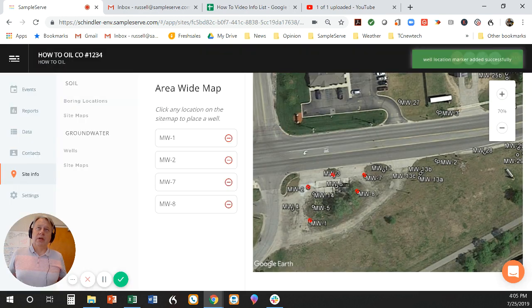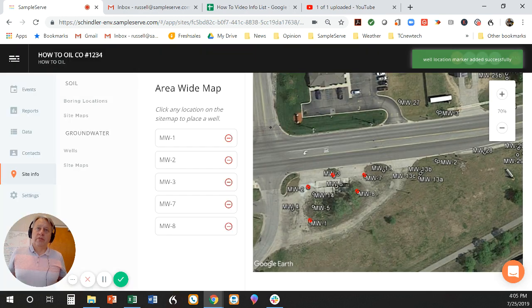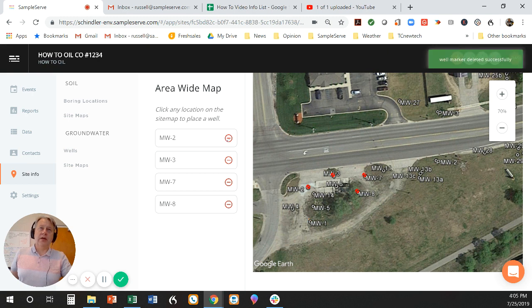Number three. There are 30-some wells here, so I'm not going to go through all of them, but that's how it works. You can see all of these here. If I do misplace something, or if for some reason you had to destroy a well, you can take it off. You don't have to put them all on here.